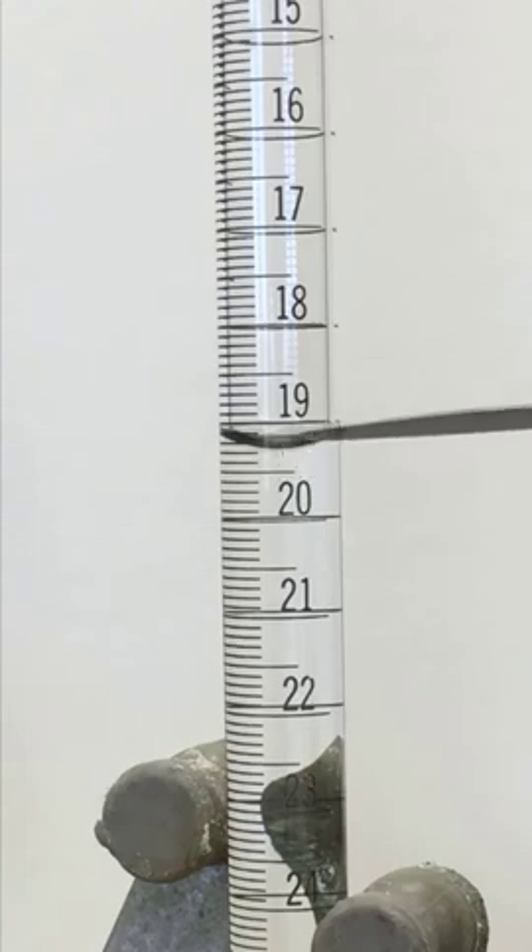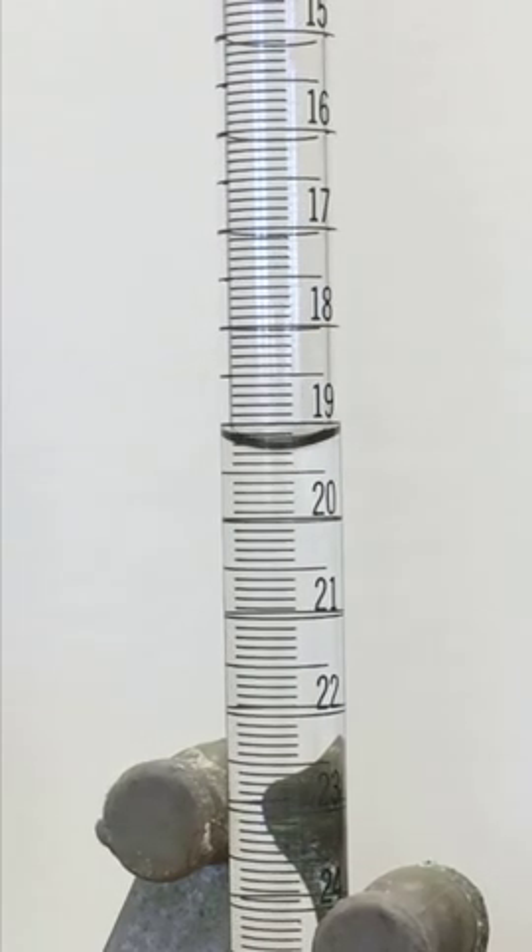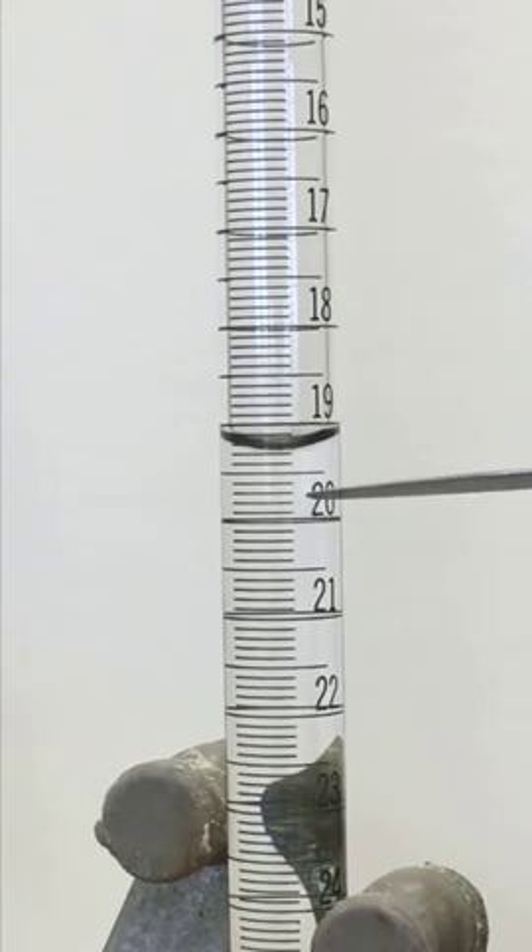You can see we're going to read the bottom of the meniscus to the top of the line. The bottom of the meniscus to the top of the line. And so the bottom of the meniscus — we see that it's between 19 and 20, so we know for sure that it's 19.